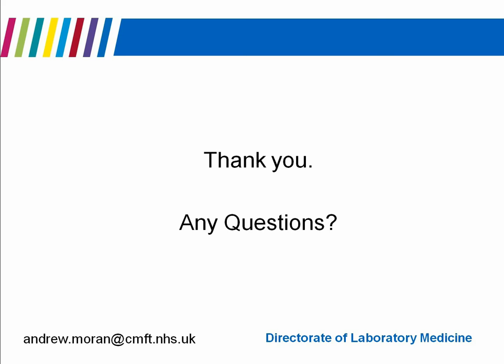I want to ask two questions. First of all, on average, how long does it take for a staff member to be declared fully competent in a flow cytometry lab? How long? How long is a piece of string? I think, obviously this is competence assessment, it's different from training.